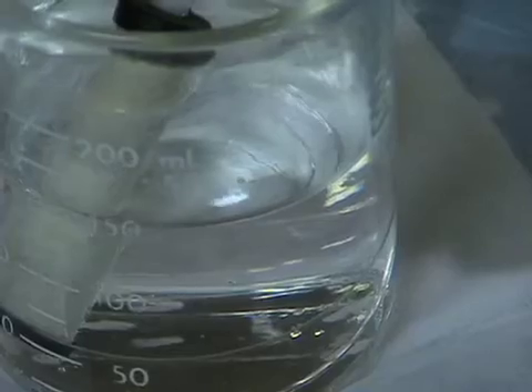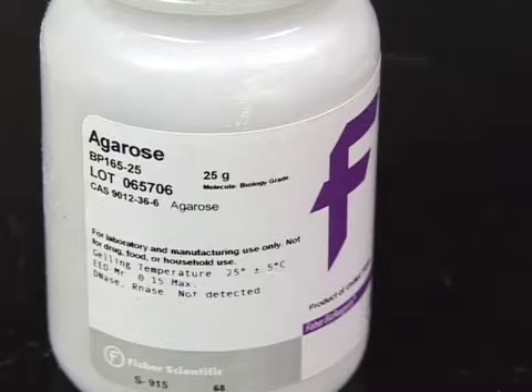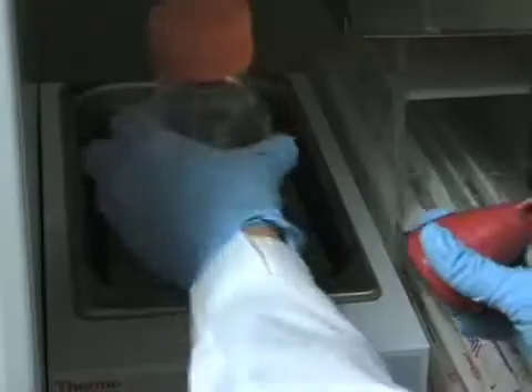Before you start the slice culture process there are a couple of steps to take care of. First you need to make your ACSF, and after you finish making it you want to get it on ice to chill as well as start bubbling it with carbogen. You'll also want to make your 4% agarose — use low-melt agarose, dissolve it in ACSF, microwave it, and then keep it at 50 degrees until you embed your brains. You also want to make your slice culture media and put it at 37 degrees so it starts warming up, so that when you put your slices in it at the end it will be at the right temperature.